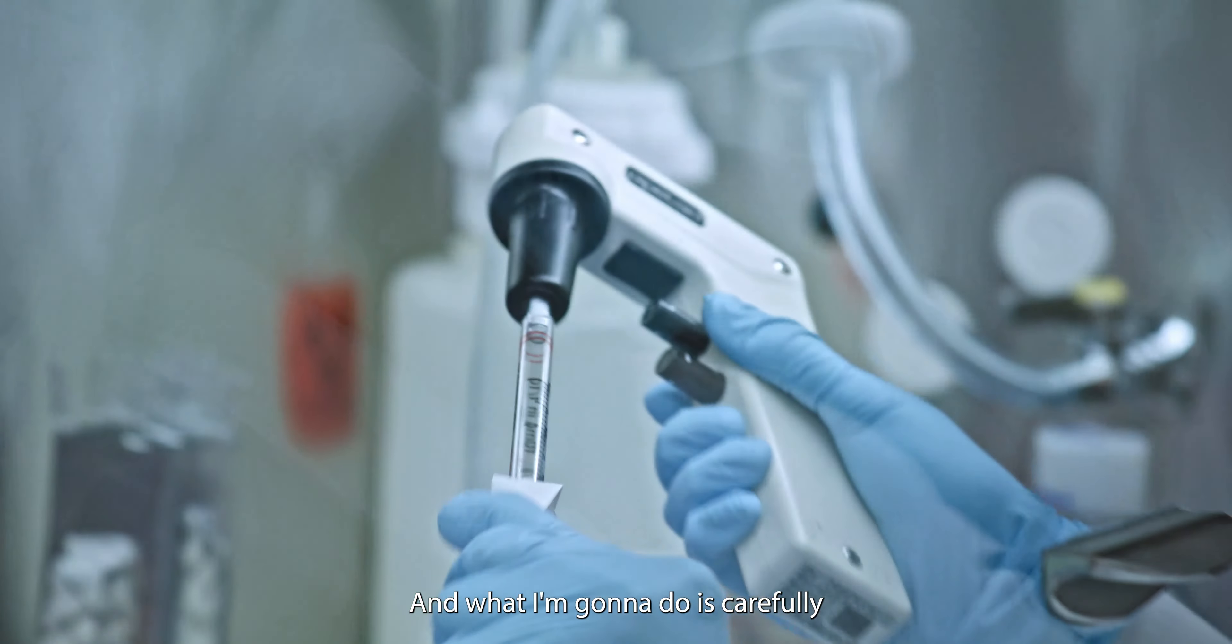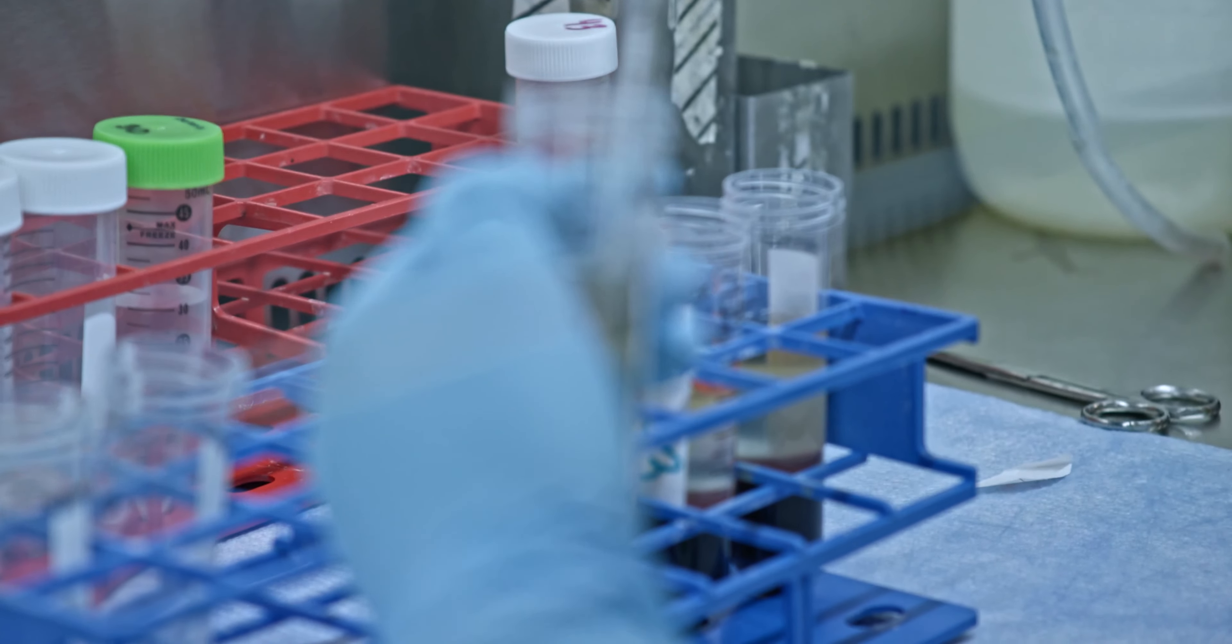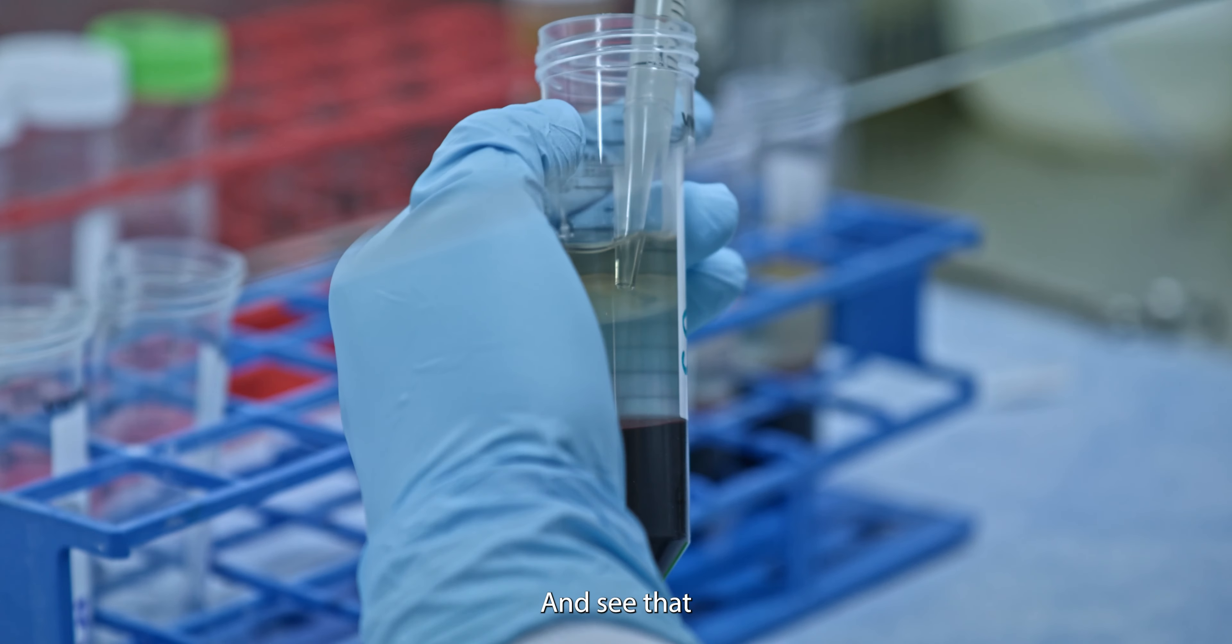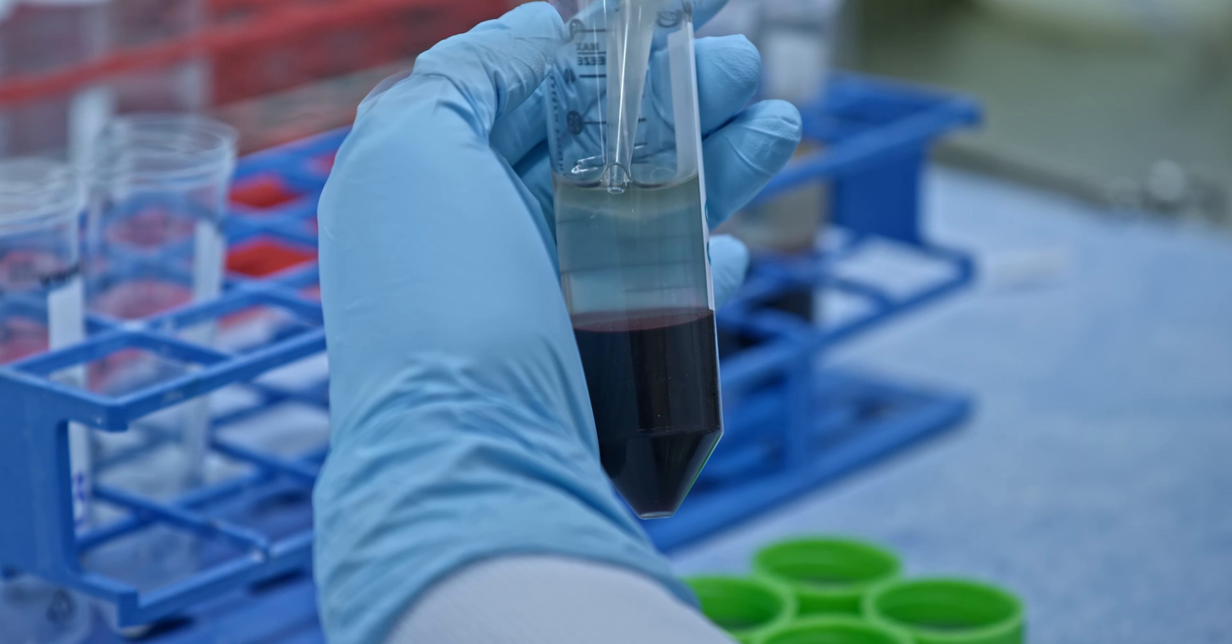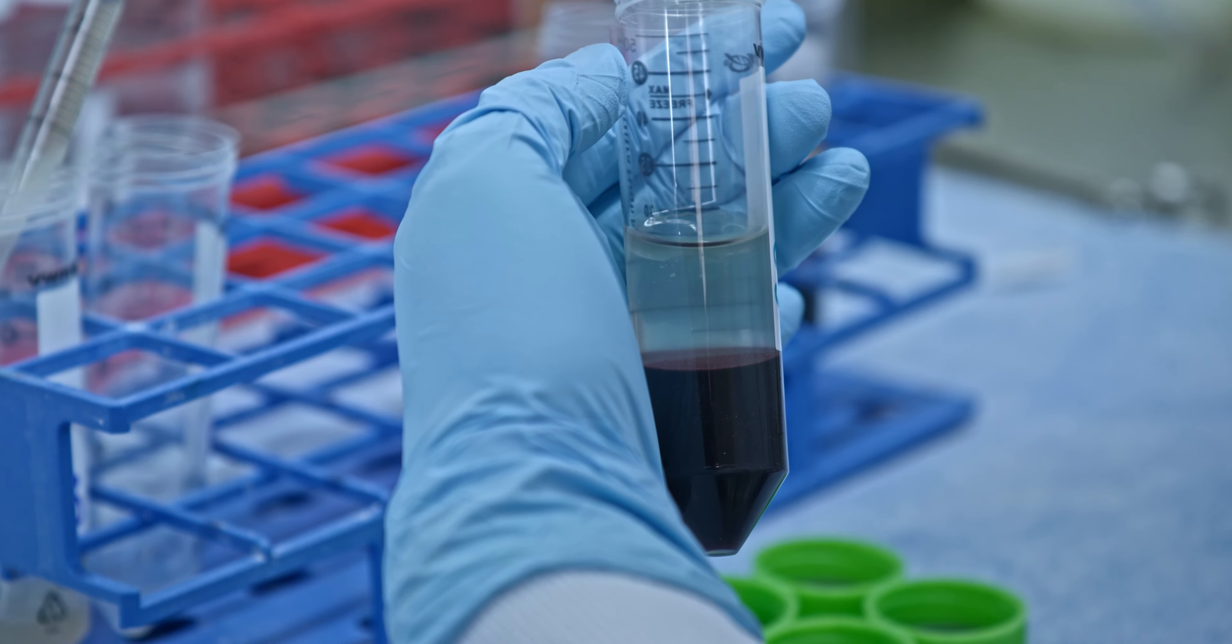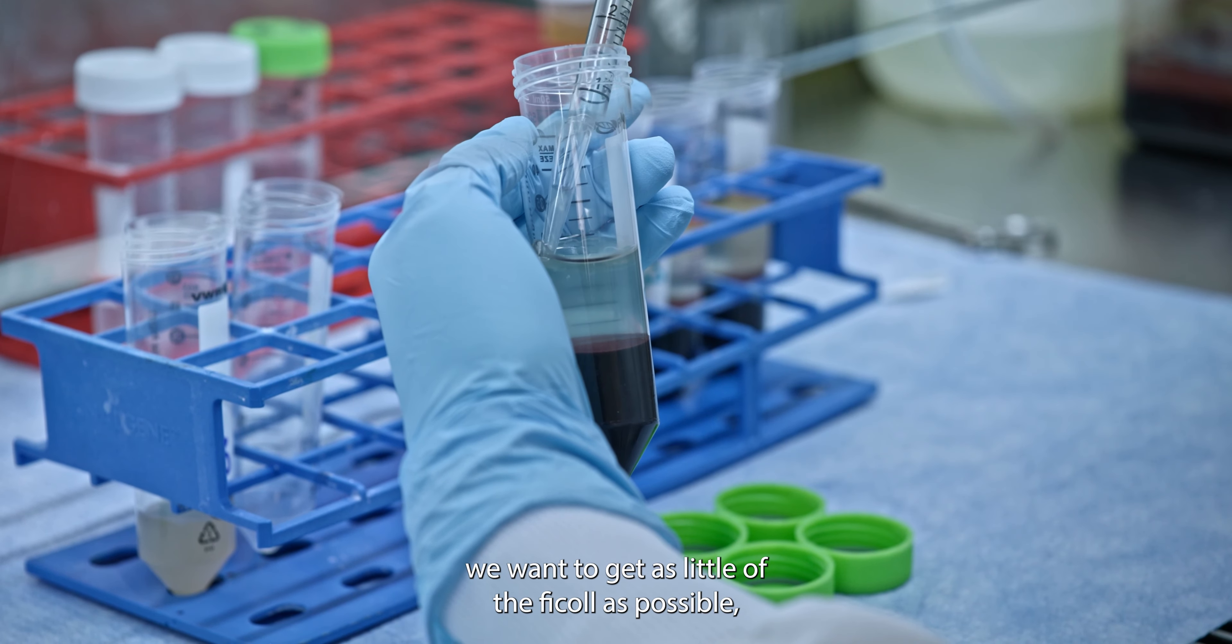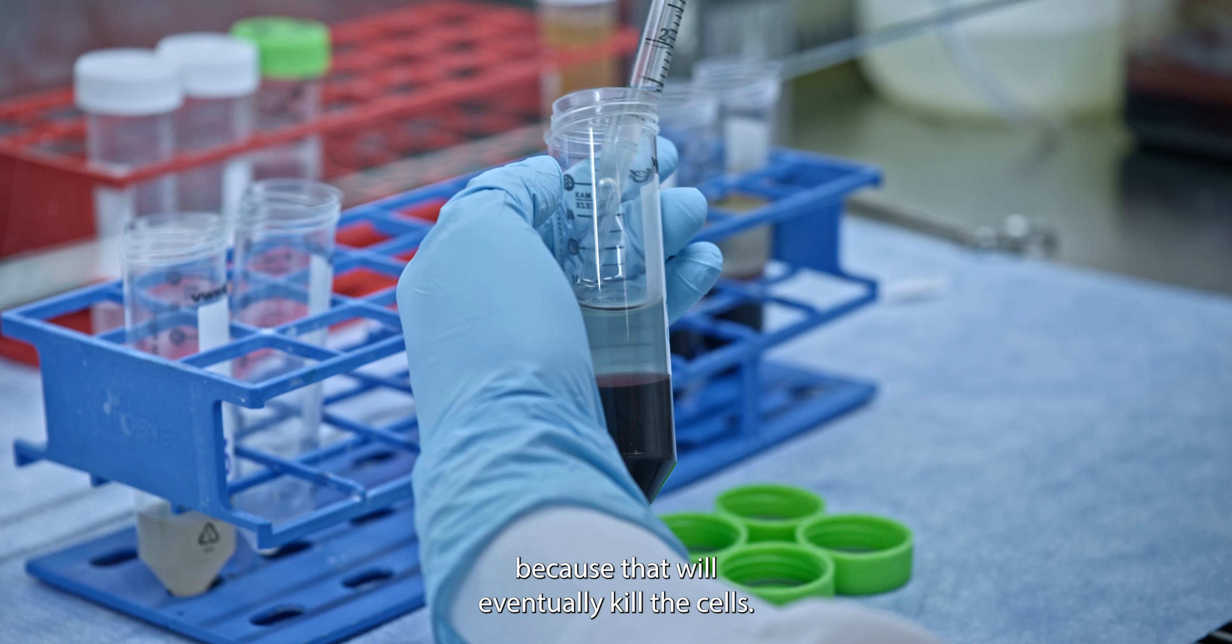And what I'm going to do is carefully take out the layer of white blood cells and put that into a new tube. When we do this step, we want to get as little of the Ficoll as possible because that will eventually kill the cells.